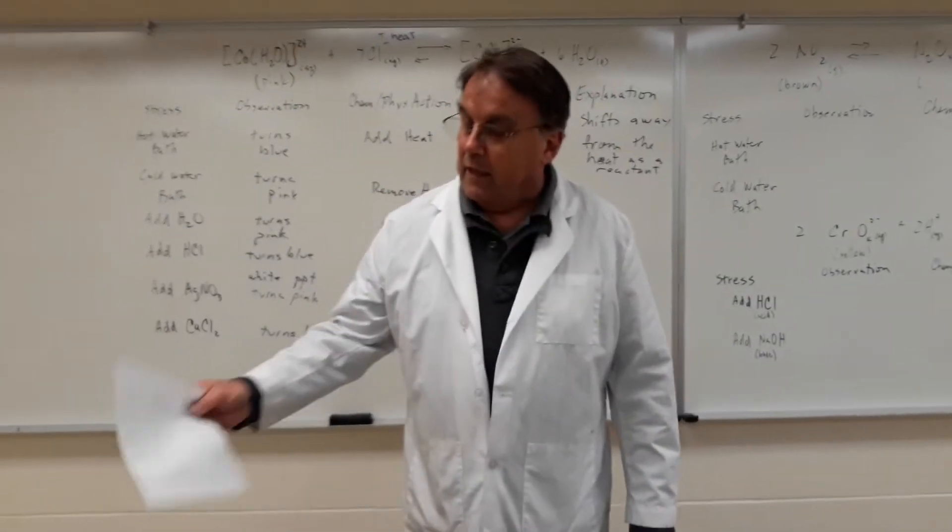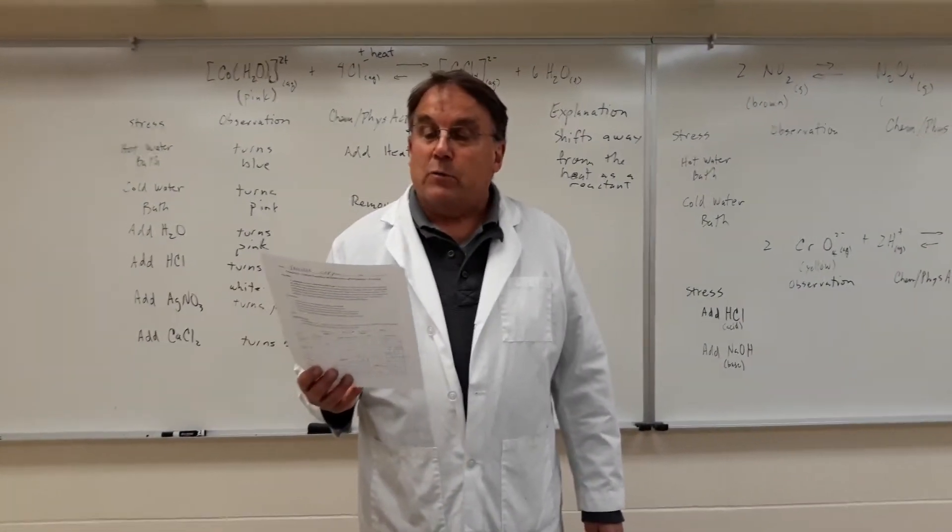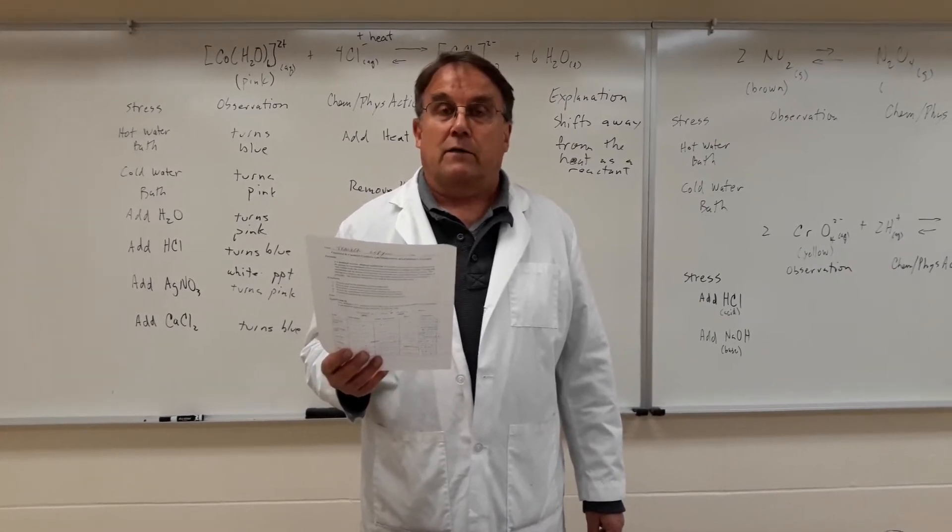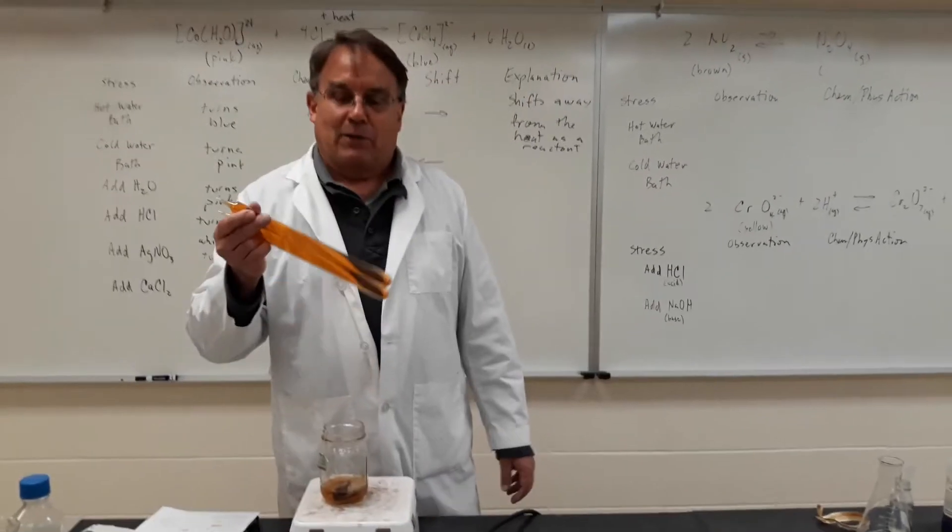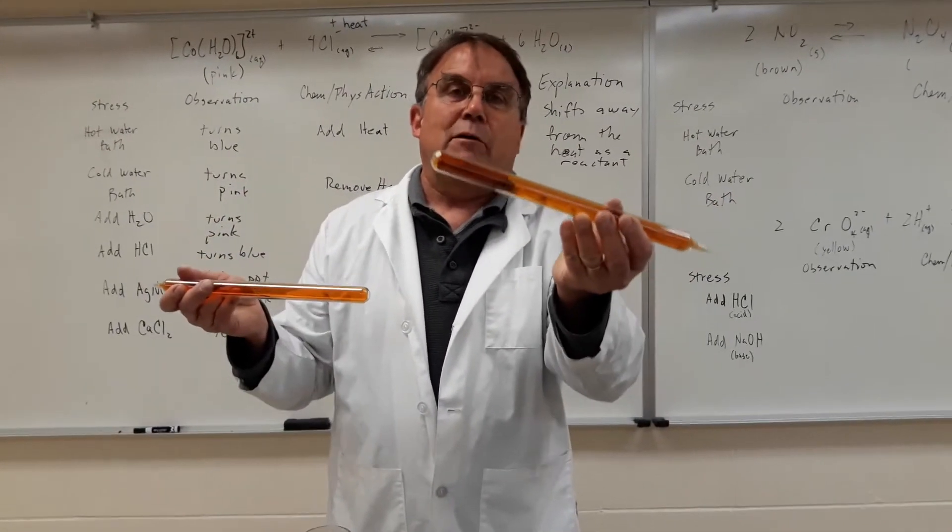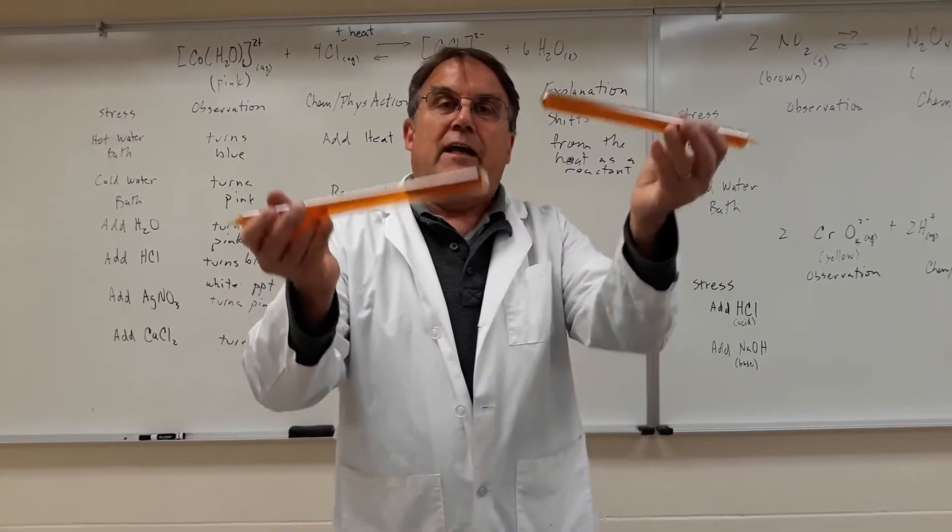All right, now we'll go to the equilibrium between nitrogen dioxide and dinitrogen tetraoxide. So here we have a couple of tubes of nitrogen dioxide, which if you've ever been to a big city on a smoggy day should look familiar.